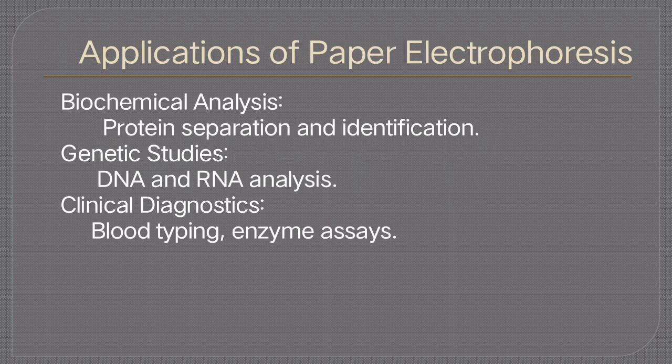Applications of paper electrophoresis: biochemical analysis, protein separation and identification, genetic studies, DNA and RNA analysis, clinical diagnosis, blood typing, enzyme assay.